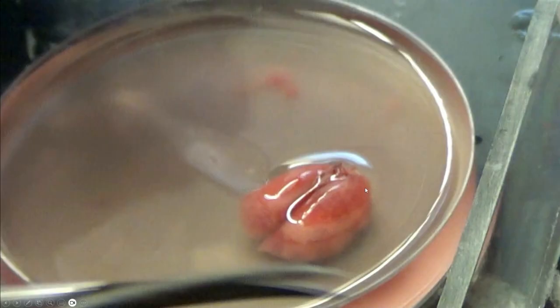The agar has solidified inside, and it's a nice firm piece of tissue that is floating in chilled Hank's balanced salt solution. It's nice to put this on top of ice to make sure it stays cold and you keep your lung tissue nice and chilled.